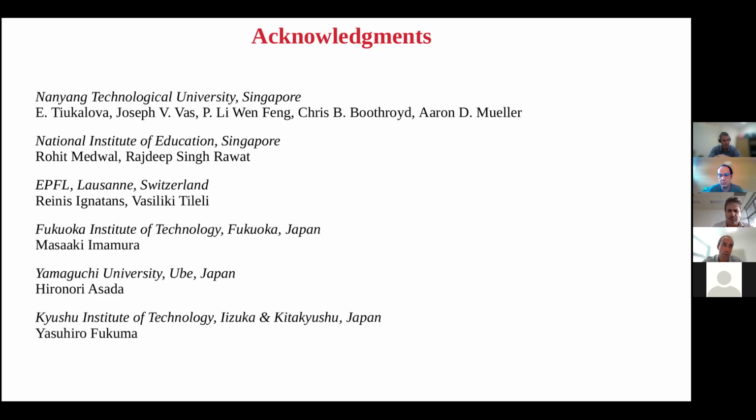And in the case of BaTiO3, when we increase the electron dose, the ferroelectric domains kind of disappear because we introduce too much charge to the specimen. So at the same time, we cannot do the visualization of the ferroelectric domain and the structural characterization at high resolution scale. So yes, we are limited by this type of aspect in BaTiO3.